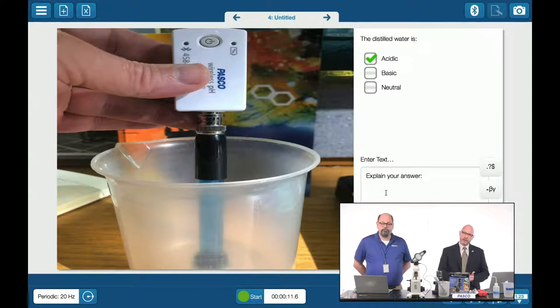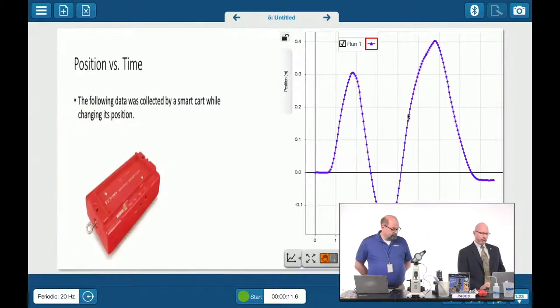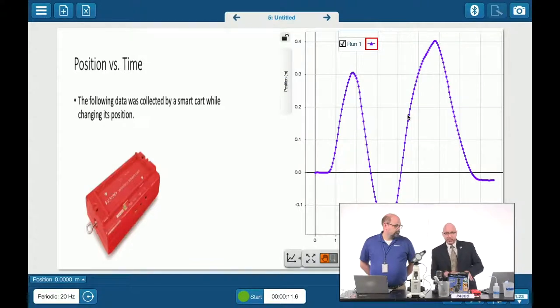So I've now created a lab within the lab software. I can write, I can show pictures, I can give some instructions, and that's just one way that I can move through and guide my students. Now, here's another thing that I've done, and in this case, I'm loving physics a little bit because I'm using our smart cart, and instead of having the students collect the data, I've collected the data for them. So this would be a case where your students aren't with you, they might be home, you want to share the data, but you still want to give them that foundation. You want them to be able to do this lab like we do this lab.